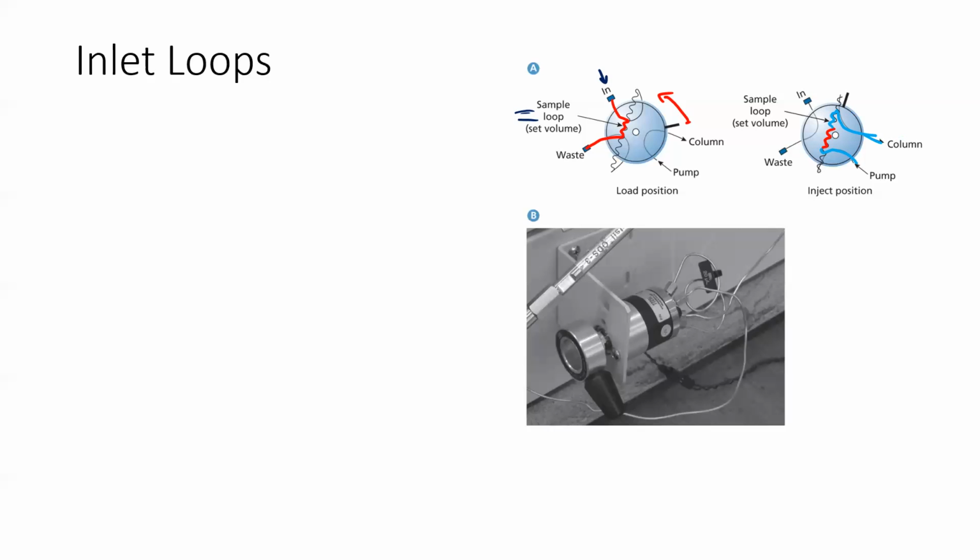It's sort of like, have any of you ever made Jello worms? So if you have a piece of Jello and then you stick a straw in it, and then you pull the straw out, right? You have this nice little Jello worm, and then you can blow it at your little brother. And the Jello worm in that example would be your sample, right?